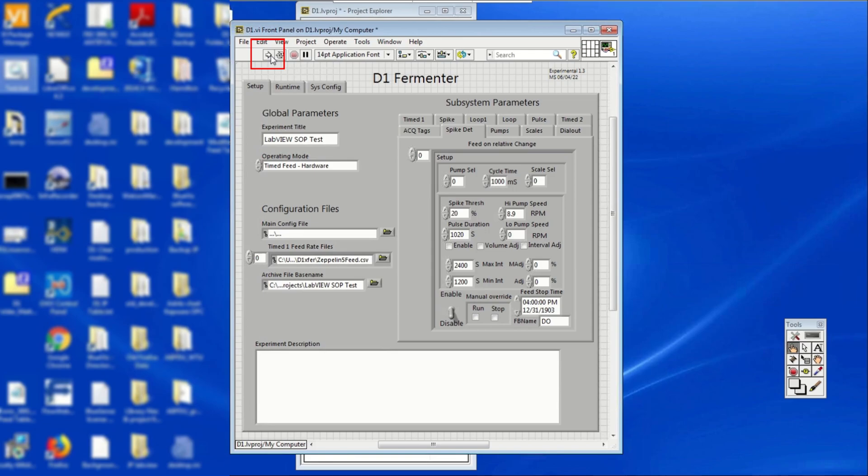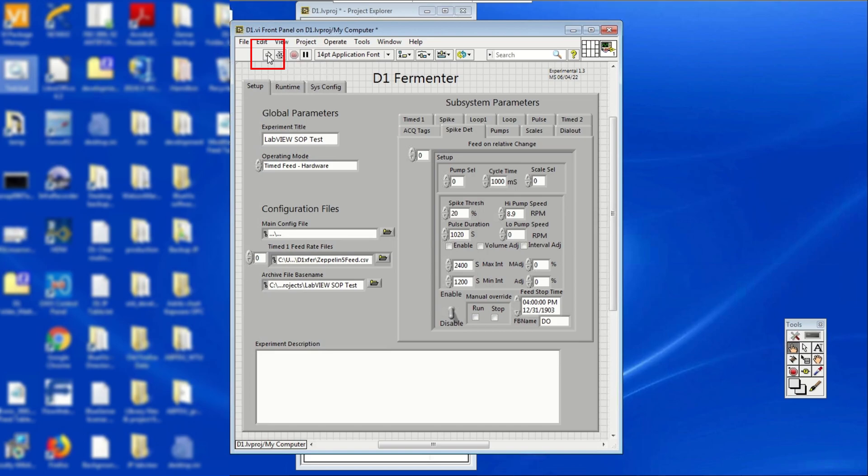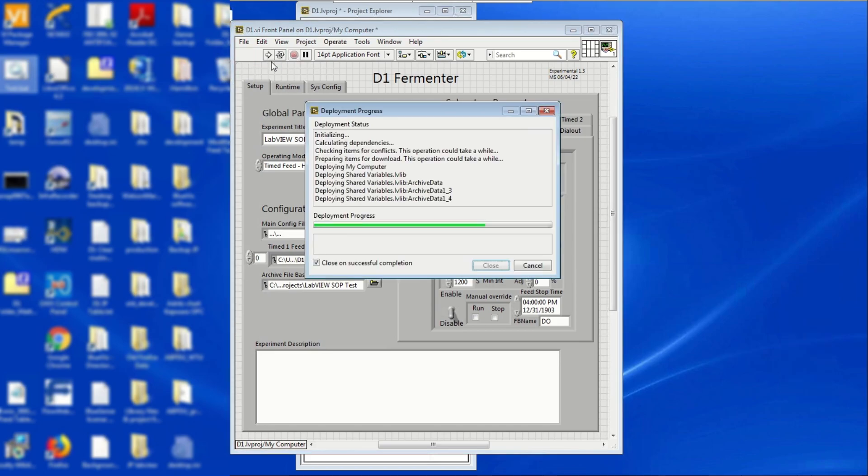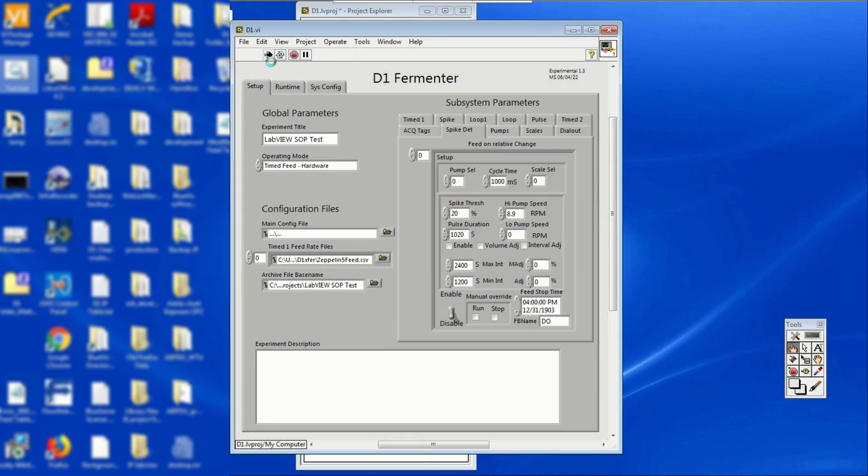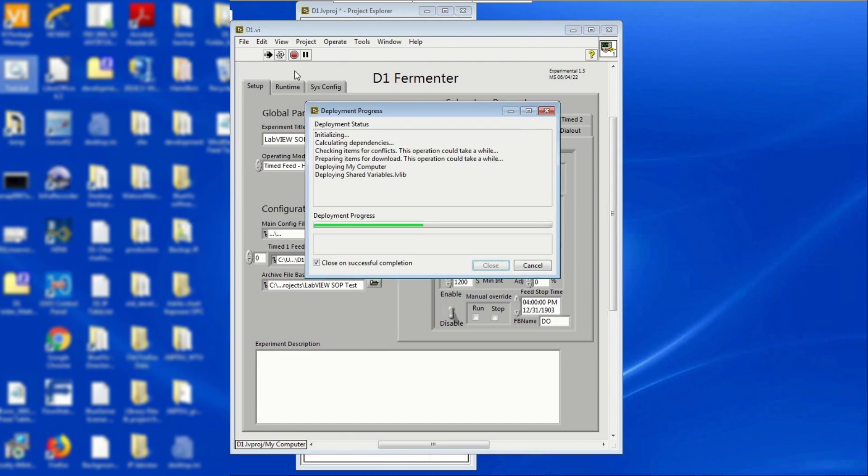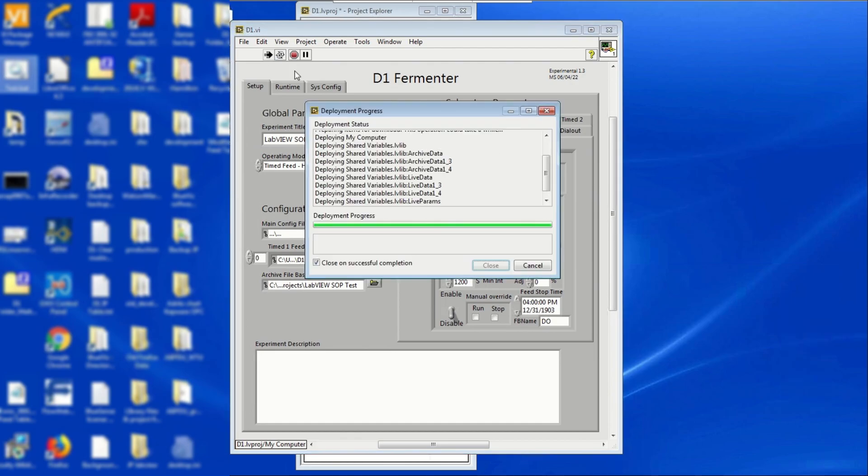We can finally run the system. In the uppermost of the front panel, below the File, View, Edit, etc. bar, locate the arrow pointing to the right. This should be on the leftmost side of the bar. Wait for the deployment progress to finish. Once done, the arrow should visibly turn from white to black.